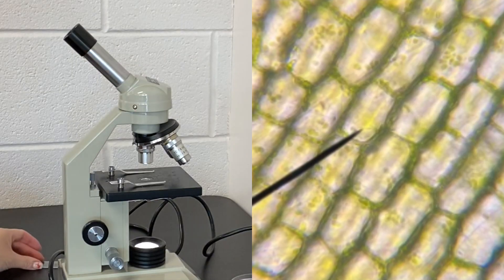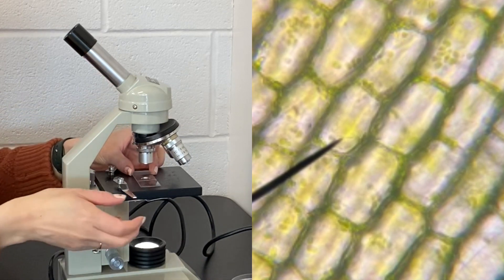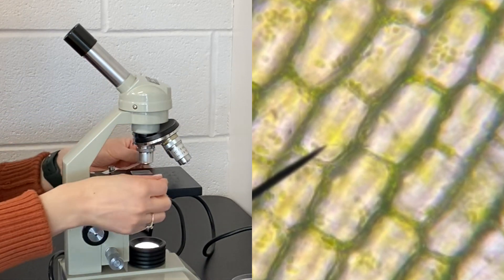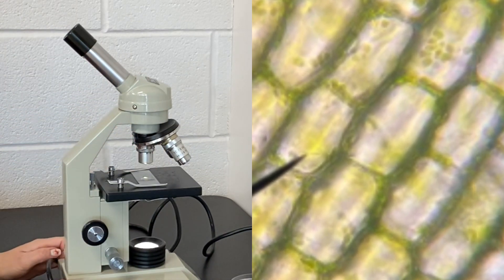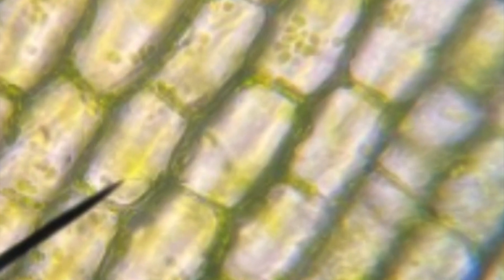You will see organelles similar to those you have seen in other plant cells, like the onion sample. However, these plant cells contain chloroplasts filled with a green pigmented chlorophyll that allow the plant to chemically react carbon dioxide and water with the energy from the sun to make glucose.